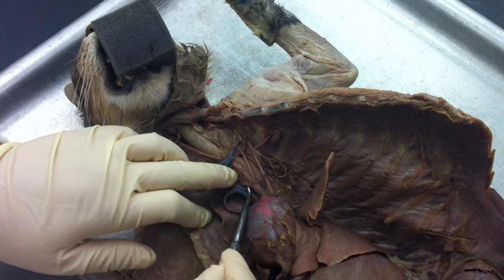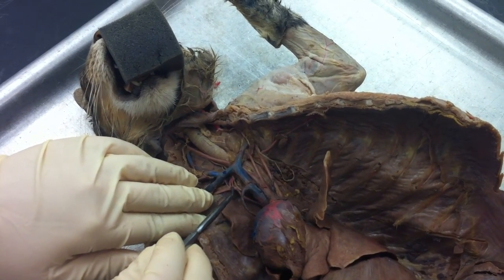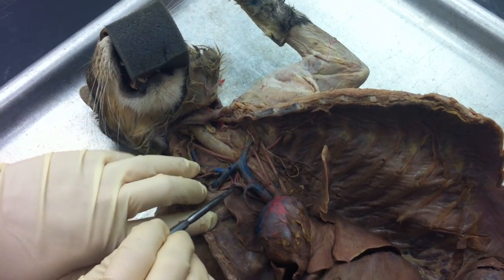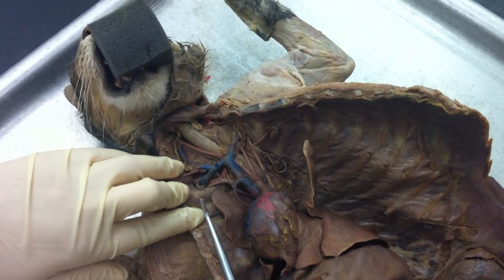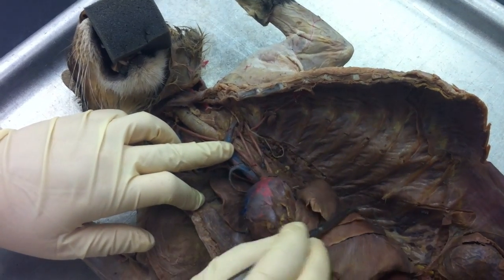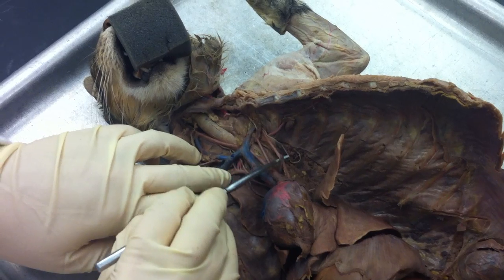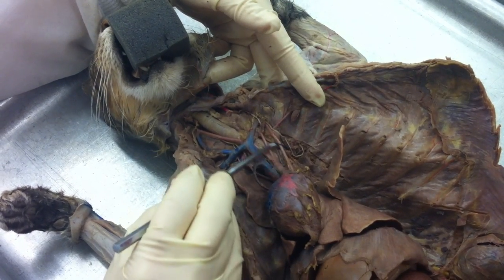The other branch that's coming off of this brachiocephalic artery is the subclavian, and it extends from where it joins right there to this split right here. Subclavian because it goes under the clavicle. The equivalent to it on the left side, that was the right, is that other branch that comes off of the aorta. This is the left subclavian.